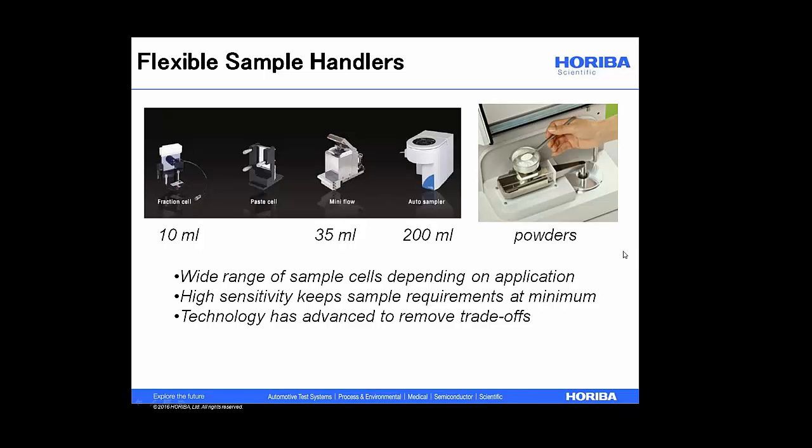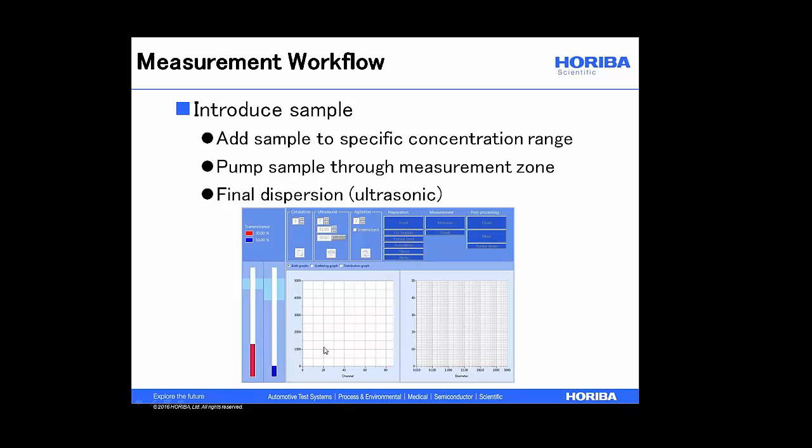Okay, I did get a question. Why is the blue transmission area generally larger than the red? Okay, so good, this example shows that. Well, this bar drops with absorption, and generally blue light is absorbed more strongly than red light. And so that's why you'll often see that trend.